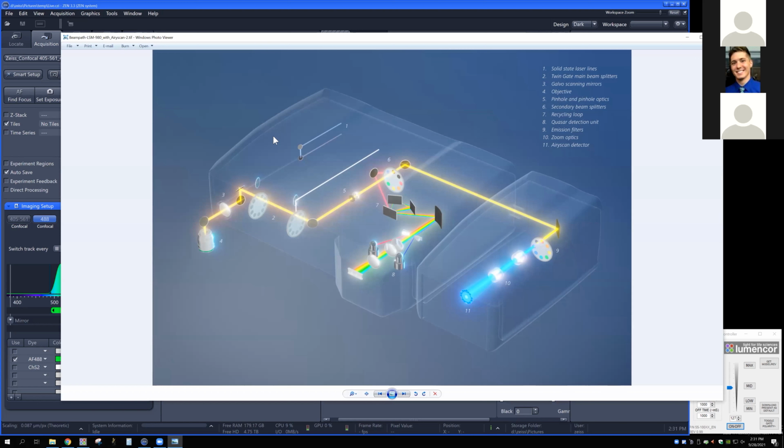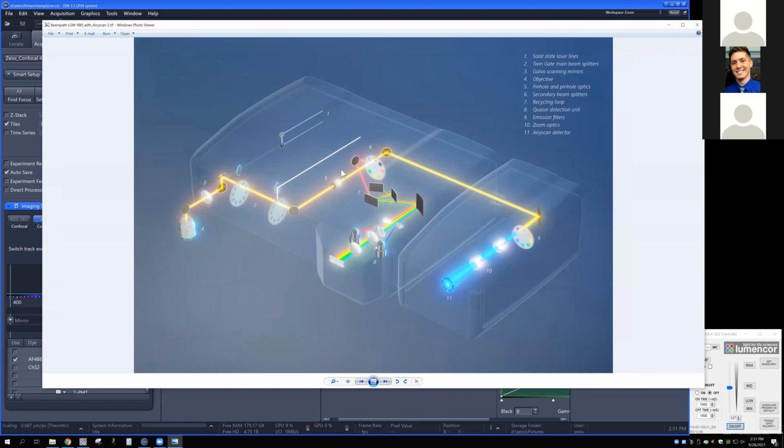This was the scan head that I showed you at the back of the microscope. And we can see that larger unit here, which is the standard scan head. And then the little shoebox on the side was the Airy Scan. And so just to break down this light path, because again, it's similar to what Cassandra had shown in terms of wide field in some respects.